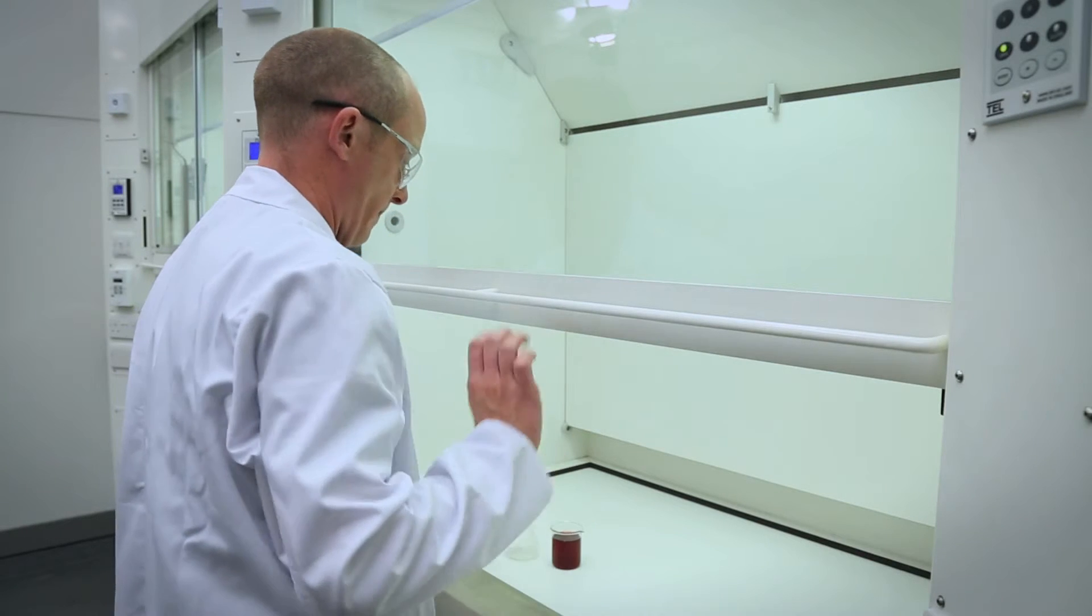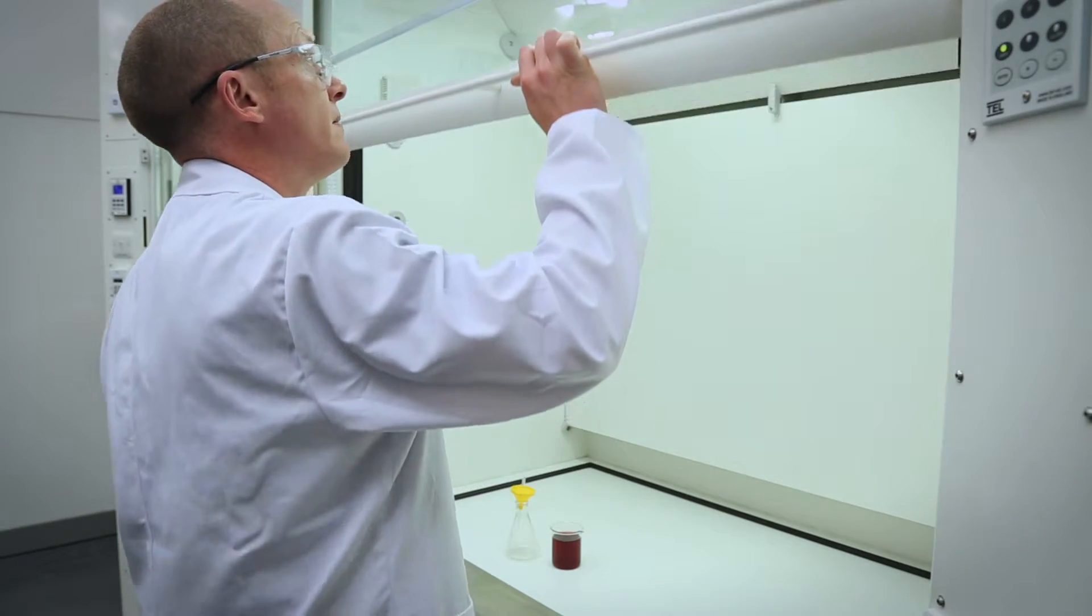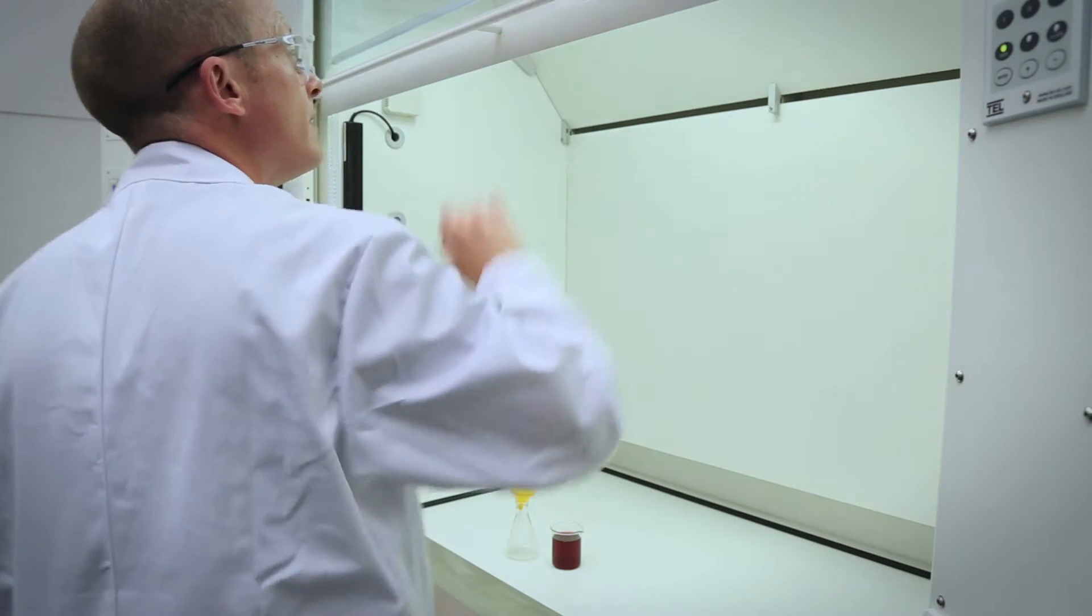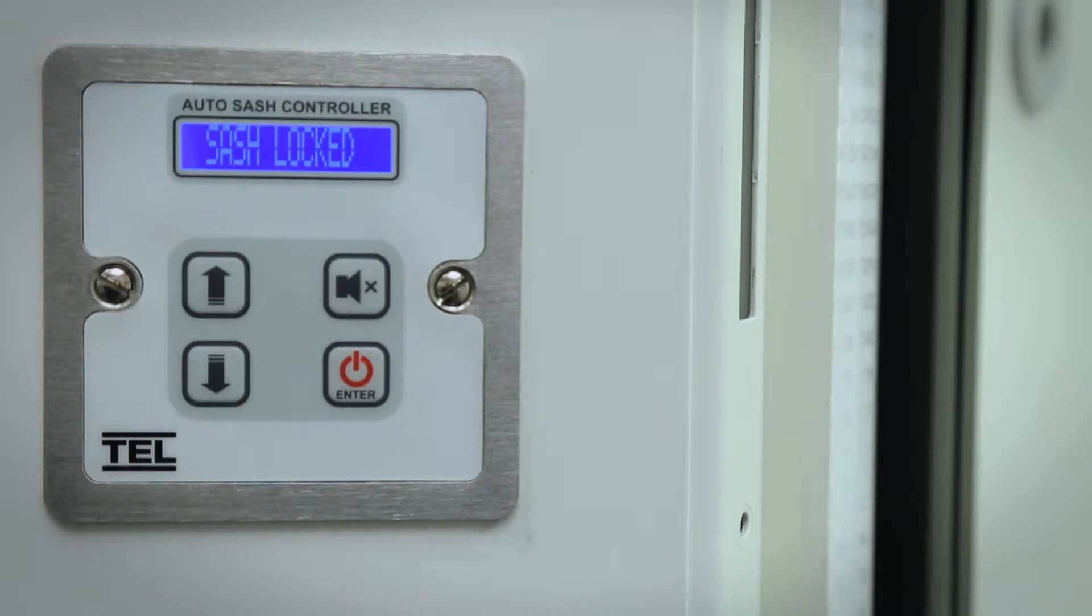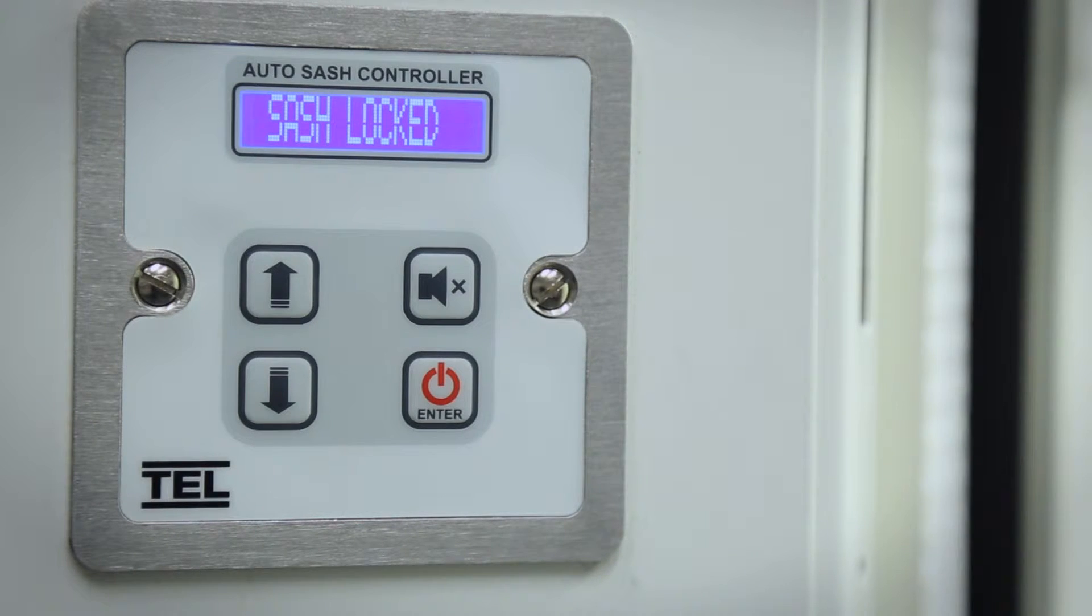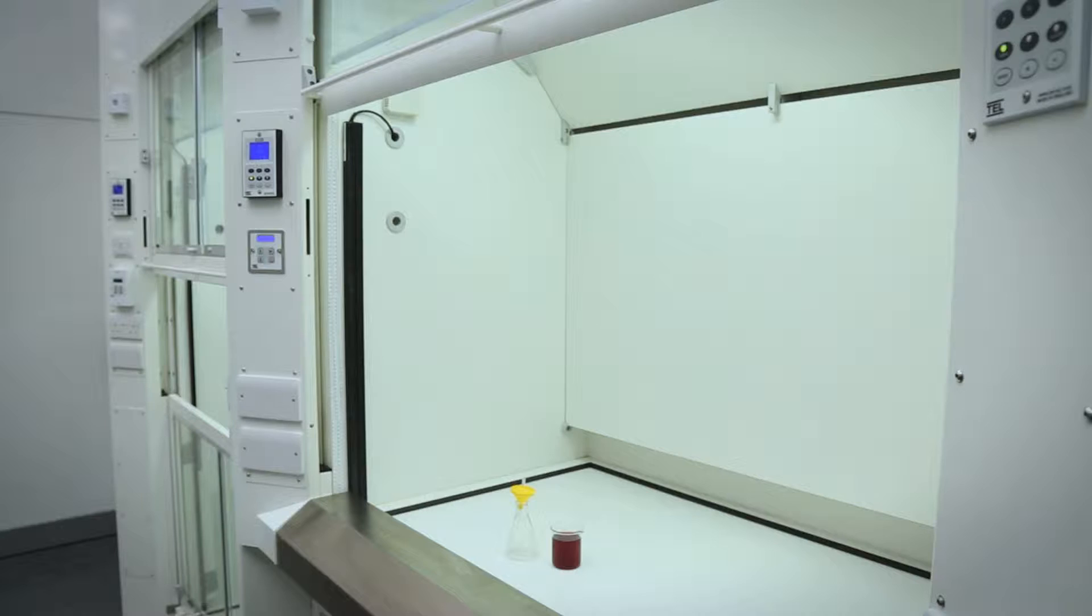When the optional sash lock feature is enabled, the user can lift the sash fully open and it will automatically disable the auto sash to allow for the loading and unloading of equipment. This will activate a timer that will give an alarm to release the sash lock if left unattended in this position for a predetermined adjustable time.